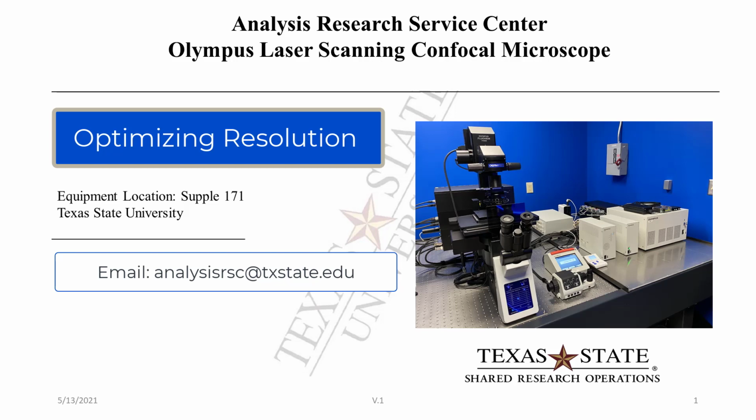Welcome to the Analysis Research Service Center Olympus FV 3000 Laser Scanning Confocal Microscope video series. In this video, I will discuss how to optimize resolution in X, Y, and Z utilizing the Confocal software and Nyquist sampling. Please remember to follow all ARSC policy and procedures and use the Confocal standard operating procedures.